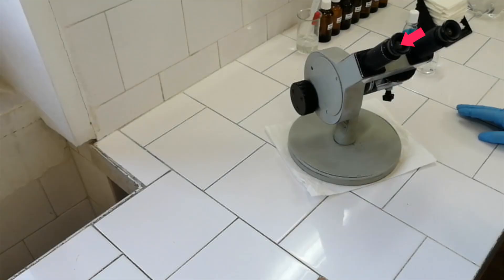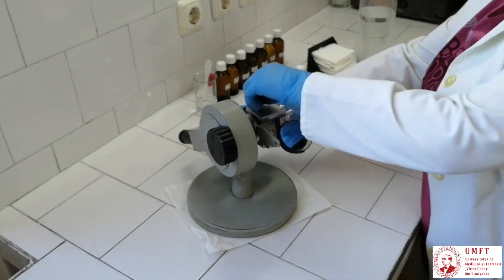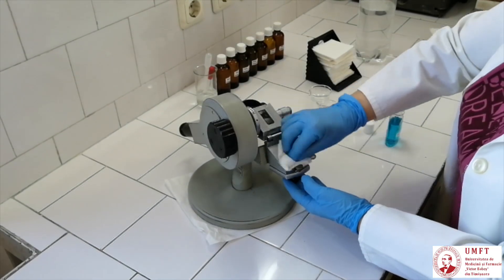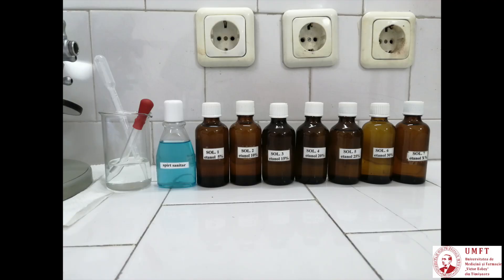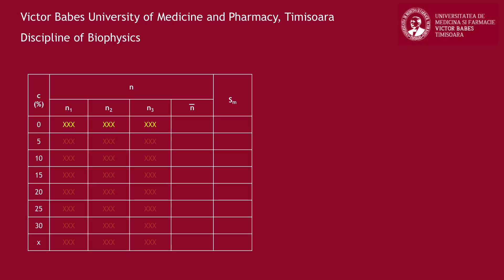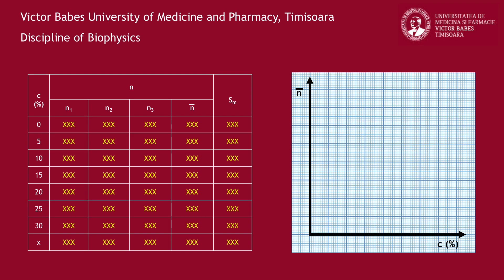Look through the reading eyepiece and read the refractive index three times. Rotate the refractometer to the upside-down position, separate the two prisms and clean their surfaces with alcohol. Use the previously presented steps and measure the refractive indices for all the studied solutions. Record all determined values in the table of your book. For each solution, calculate the mean value of refractive index and the associated standard error. Using millimeter paper, plot the mean values of refractive index as a function of concentration. Finally, by linear interpolation, determine the unknown concentration of the studied solution.